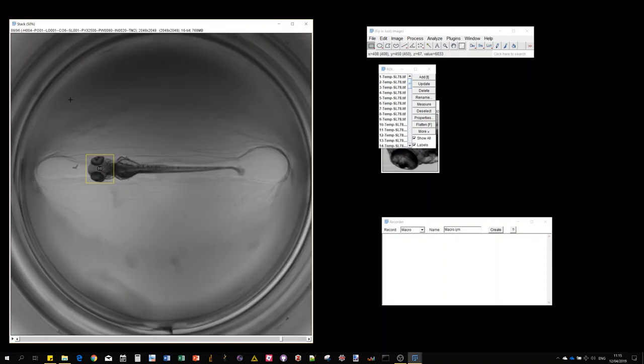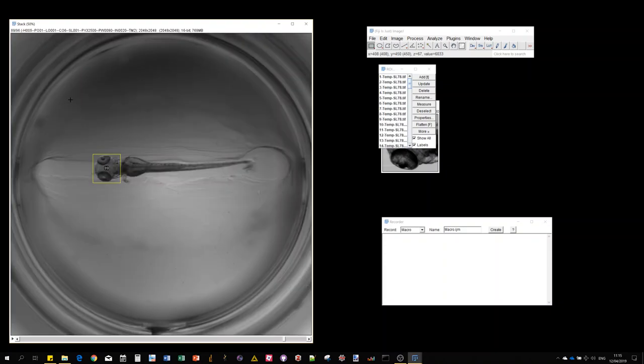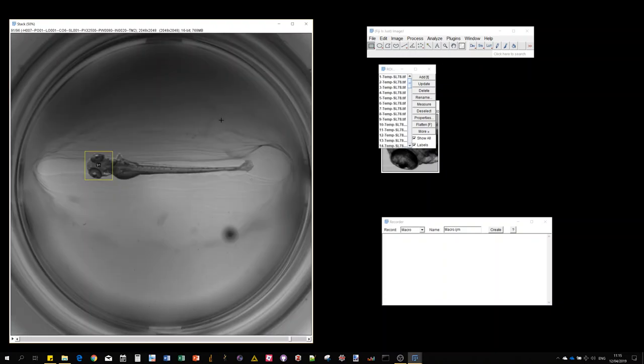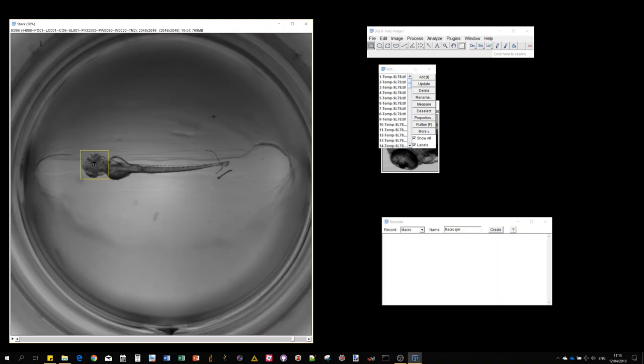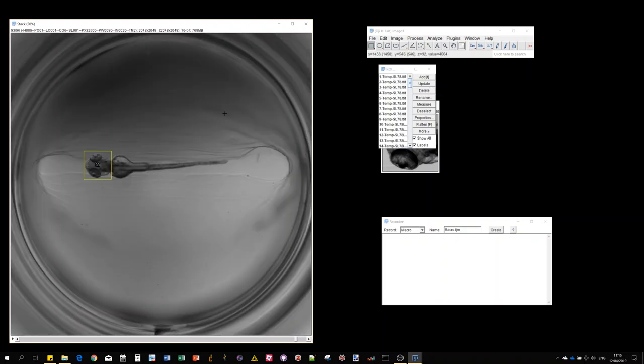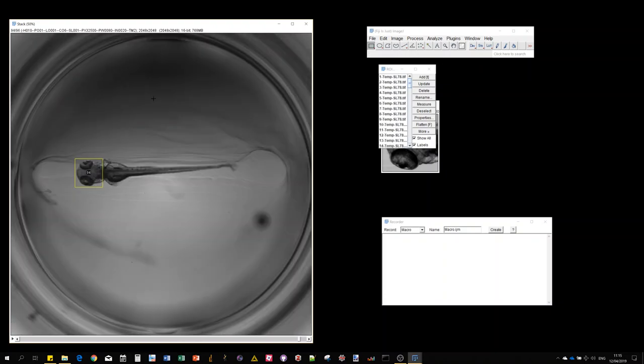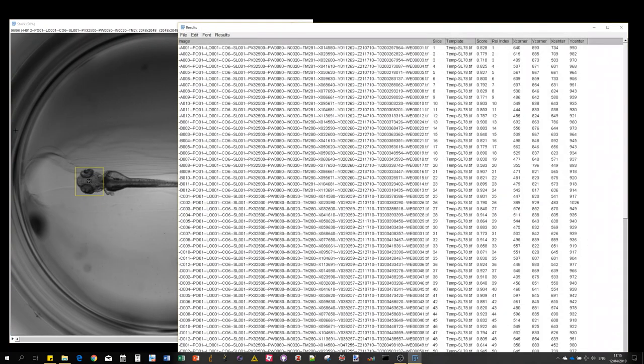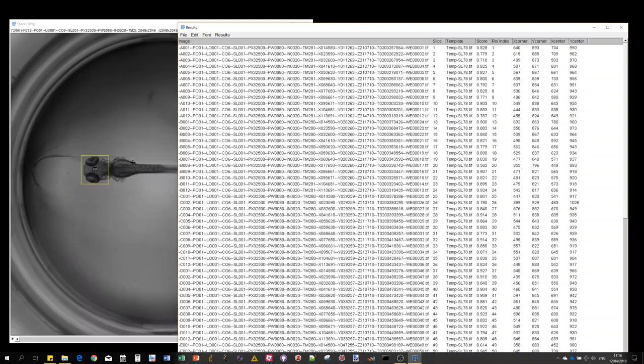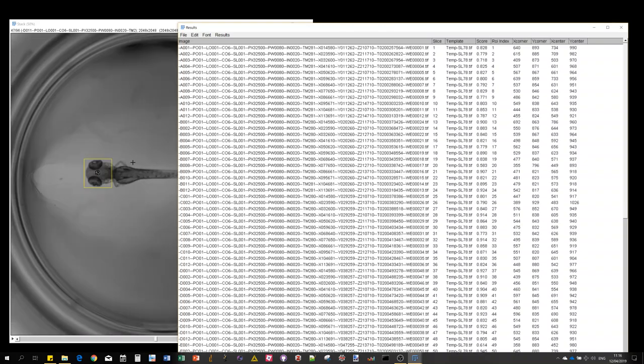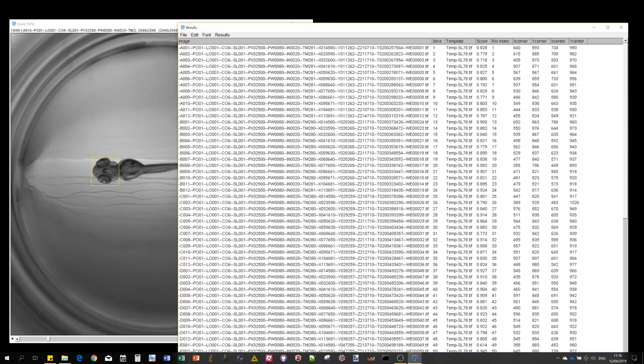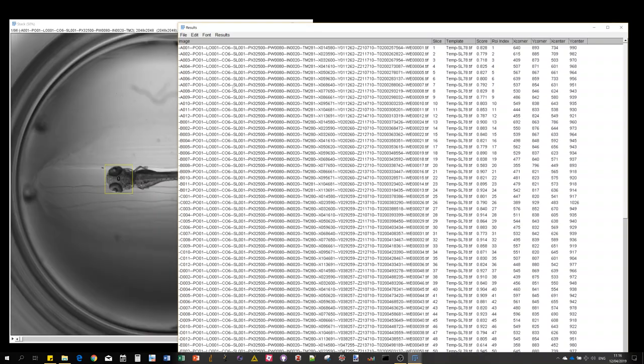The analysis is about half a second for each image with this picture size of 2000 by 2000 pixels, which was the full field of the camera. Now we get the result table.